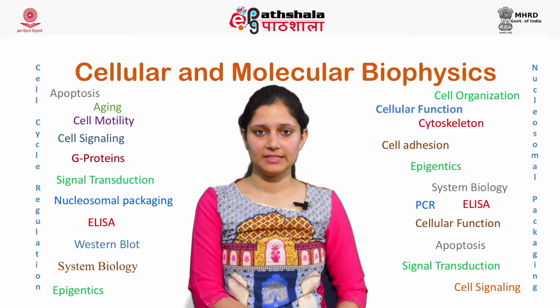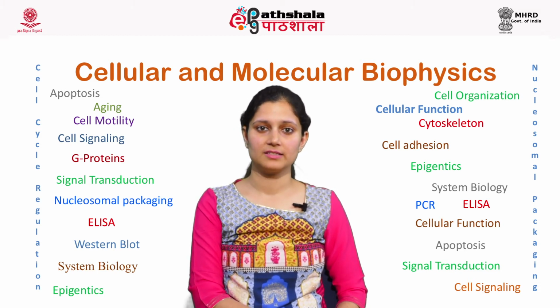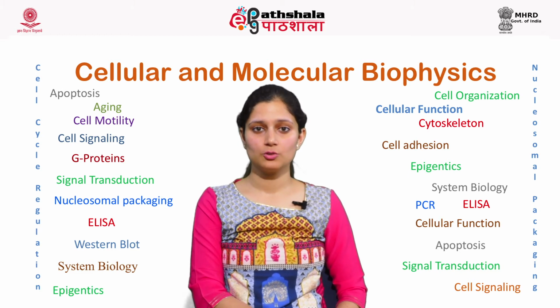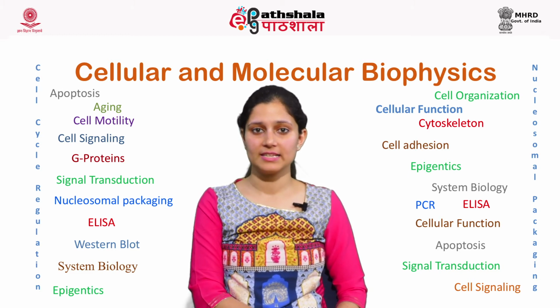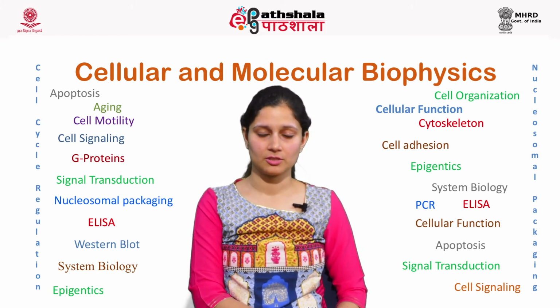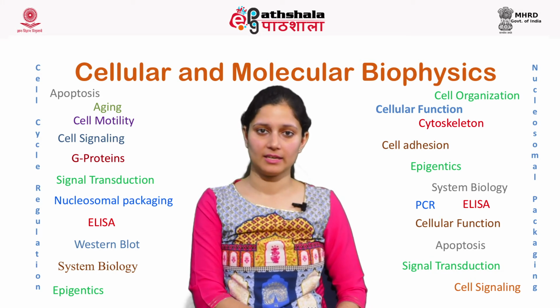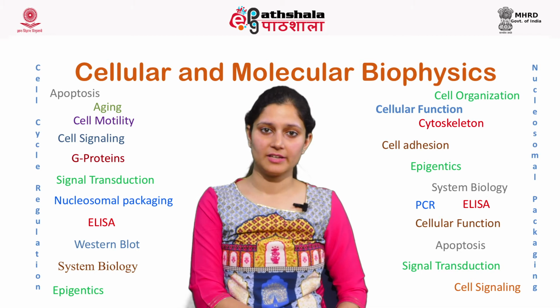The next step, annealing, in which the primers attach to the single-stranded DNA because primers have complementary bases to flanking regions of your desired DNA. And the third step, in which DNA polymerase acts and cause extension of these primers to cause amplification of the desired DNA.